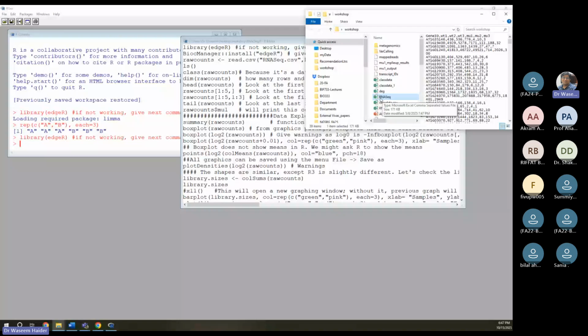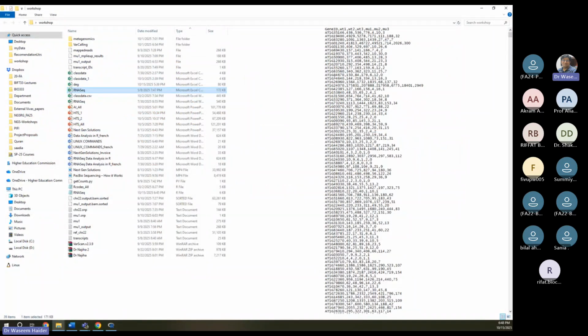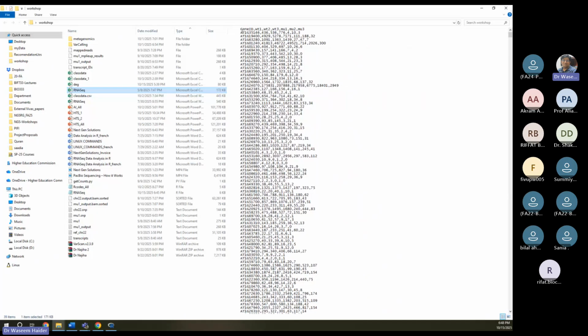R is good at reading CSV files. For data analysis, Excel sheets, I guess most of the tools love them to be in this CSV format. What was the CSV format? Windows is smart, so it also opens that CSV in this side view, and it tells us this file looks like this, right?